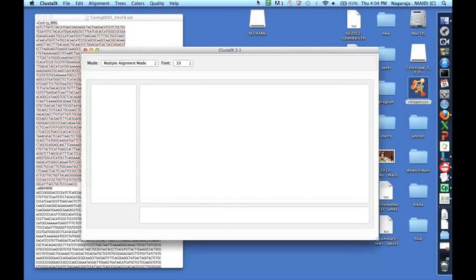Global multiple sequence alignment using ClustalX. If you need to make a multiple alignment of biological sequence data, ClustalX may be a good program to use. If your data are DNA that are protein coding and do not have a huge amount of sequence diversity, then the global alignment algorithm implemented in ClustalX can give a good result.